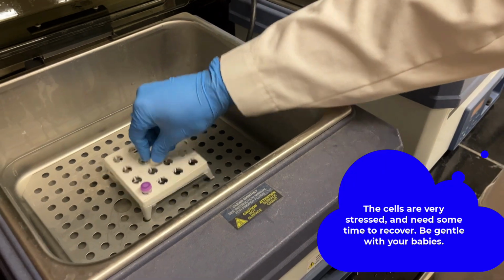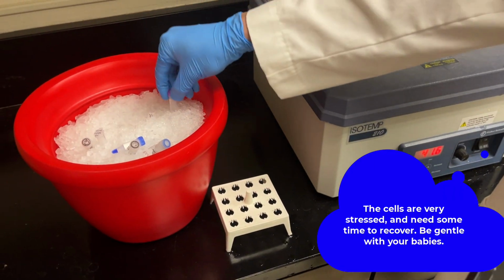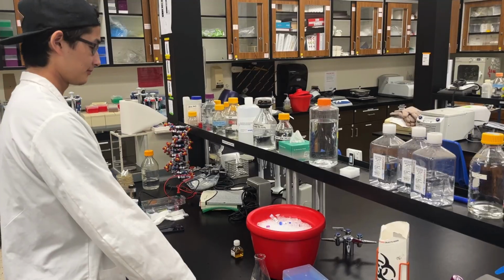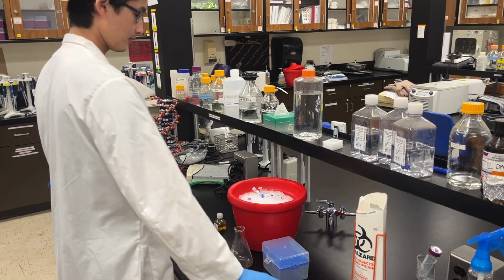After the shock, it's important to plunge the cells straight into ice. Allow the cells a little time to recover. They have been quite stressed during this time, so let it sit on ice for about 2 minutes. After the heat shock stage, we hope that the cells have taken up the plasmid DNA.